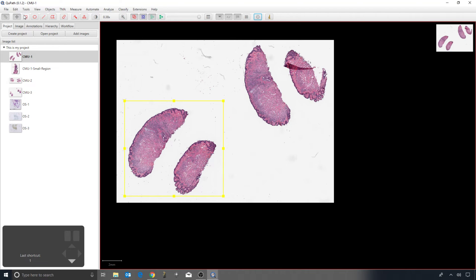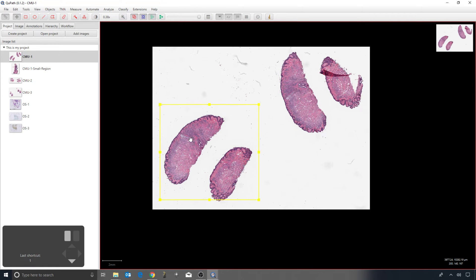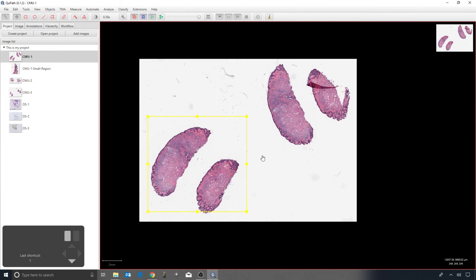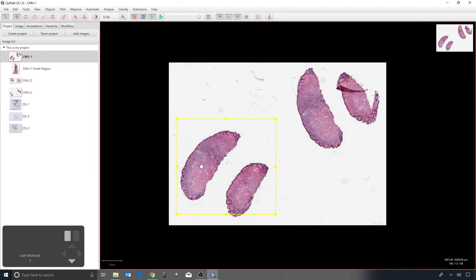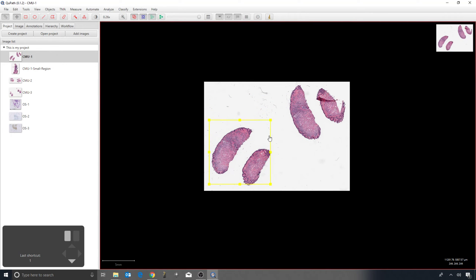Going back — I've created my rectangle and I'm back on the move tool. I can click and drag to move around the image, but I can also click and drag inside the rectangle to move it. If I'm outside the rectangle I'm moving the image; inside, I'm moving the rectangle. The rectangle is shown in yellow to indicate it's selected. I can also click the small square handles at the corners to resize it, and holding shift constrains it to a perfect square — both when drawing and when adjusting handles later.